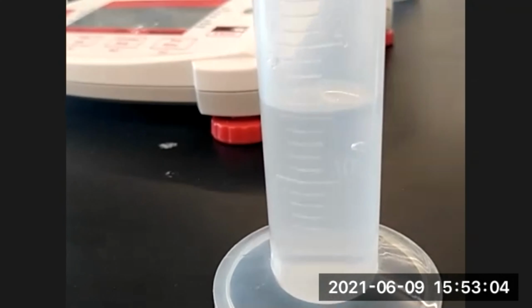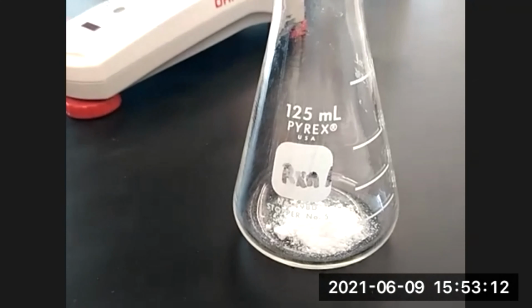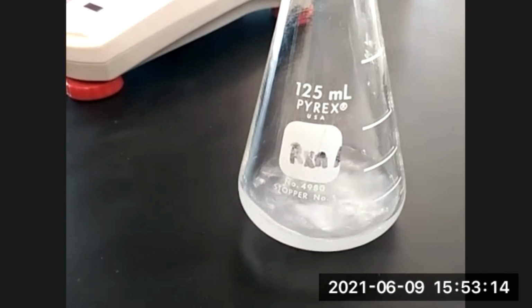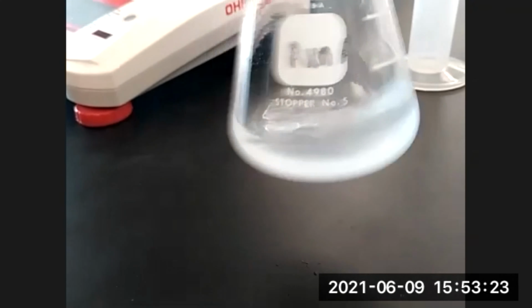So now we're going to add 15 milliliters of DI water to the Erlenmeyer flask. And make sure all the sodium bicarbonate completely dissolves before you move on to the next step.